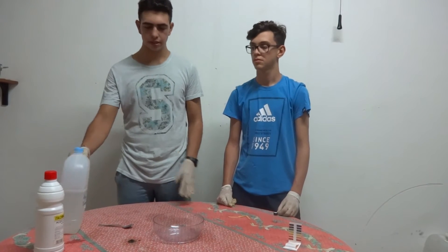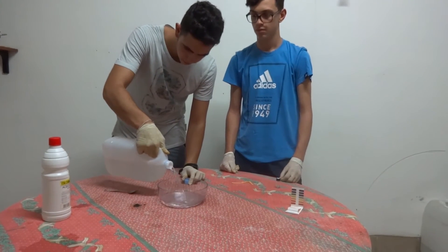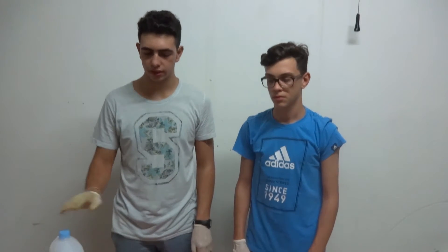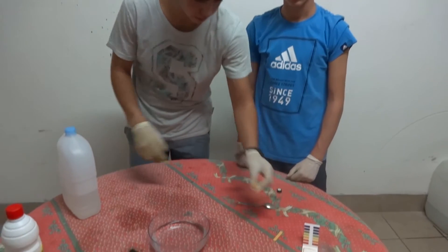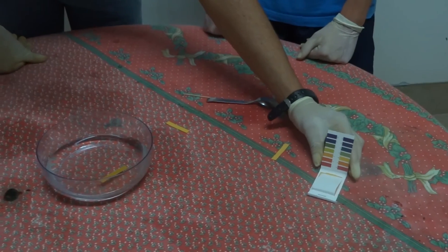So now we put the distilled water into this jar. Once we put the water into this jar, we can test that the water is neutral. We put an indicator paper and we see how it turns to green, and on this scale we can see that green is the color of neutral water.